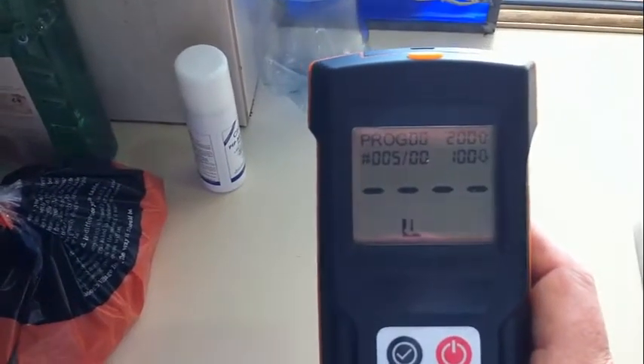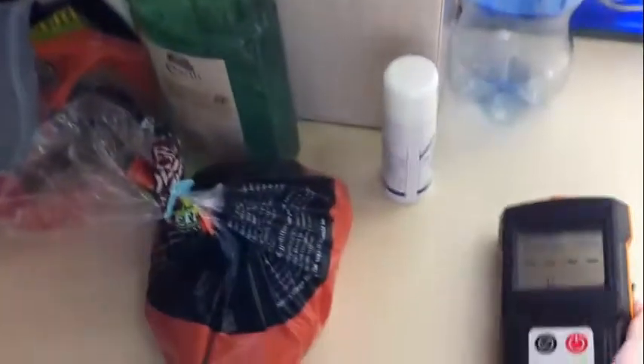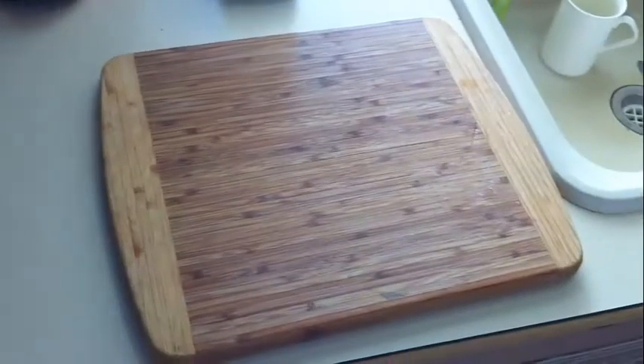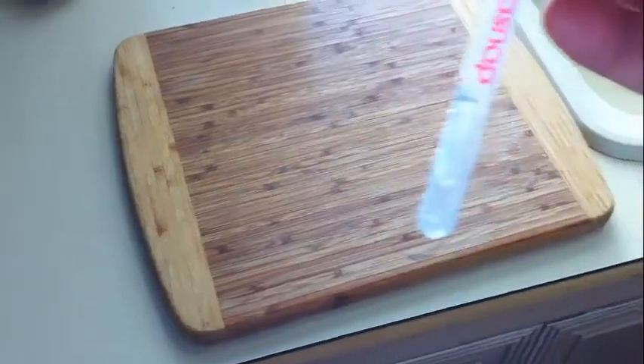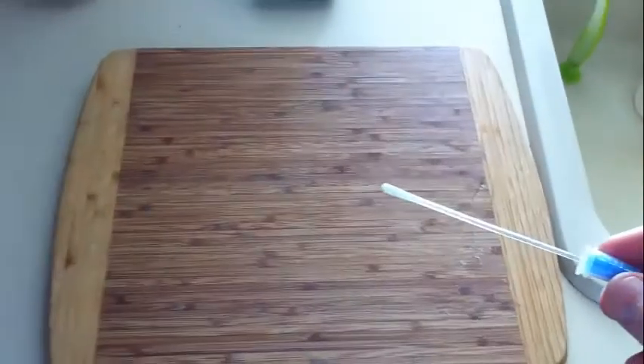And voila, we're now ready to go and there's a little arrow there saying put the swab in. Here is a worst case scenario — there is our test swab. You can see it's actually got the liquid in there, the cotton bud in the bottom, and what we want to do is simply take that out with the cotton bud and just swab anywhere on the surface.